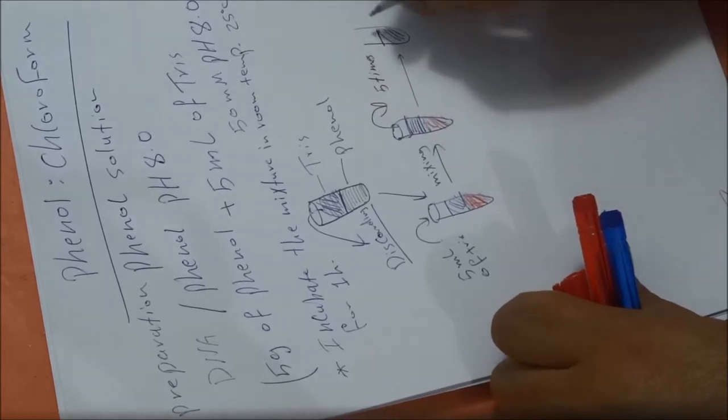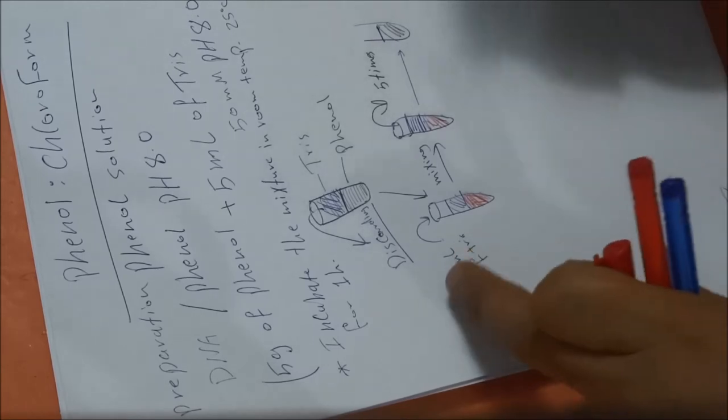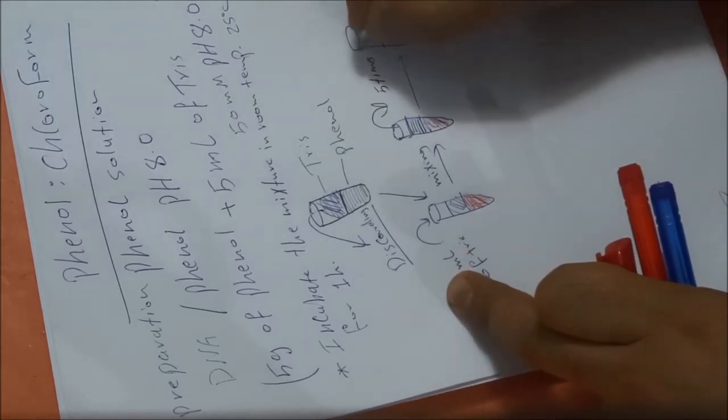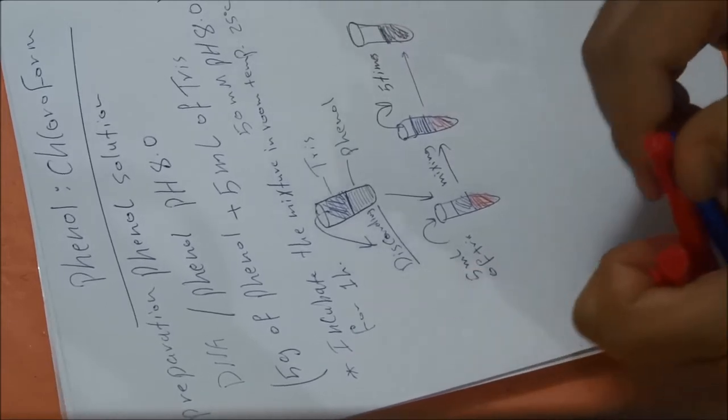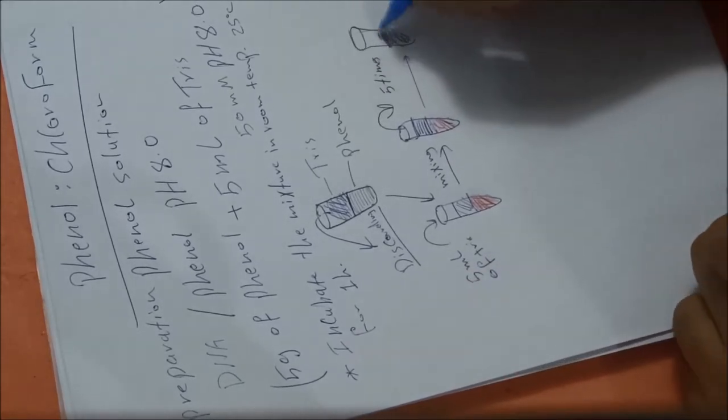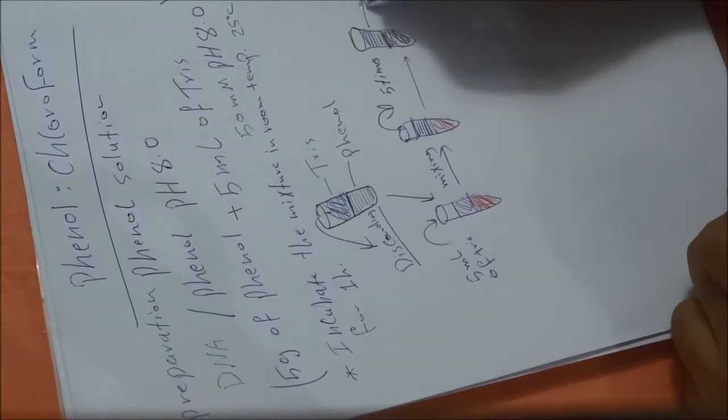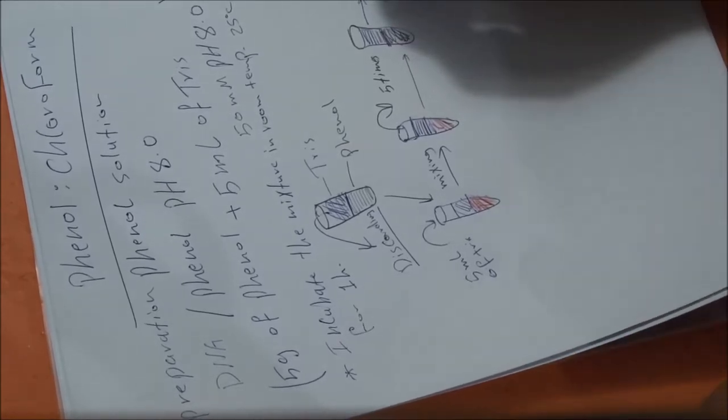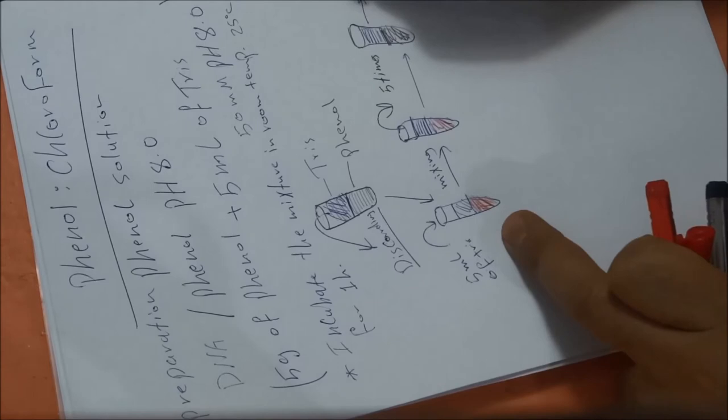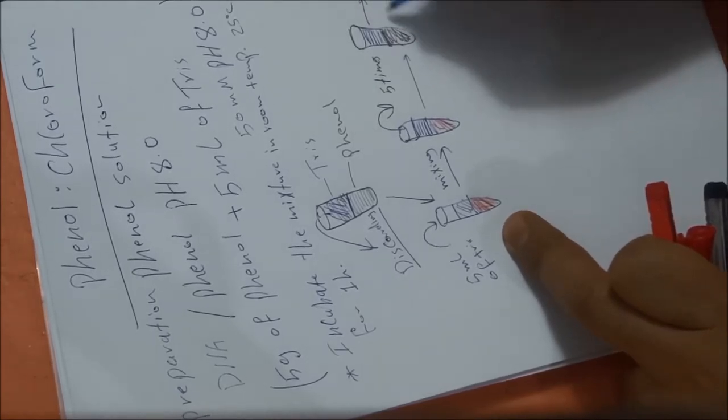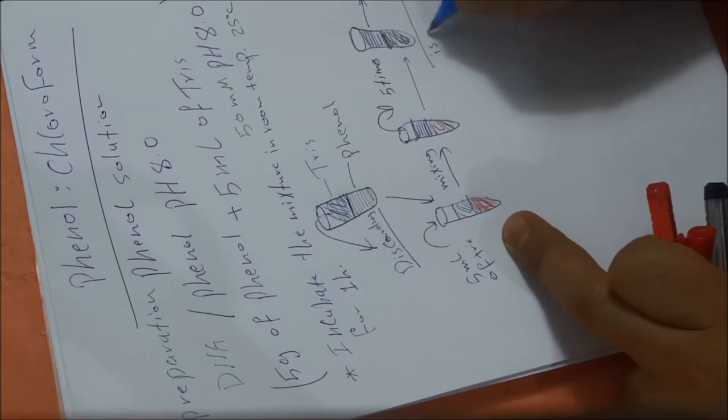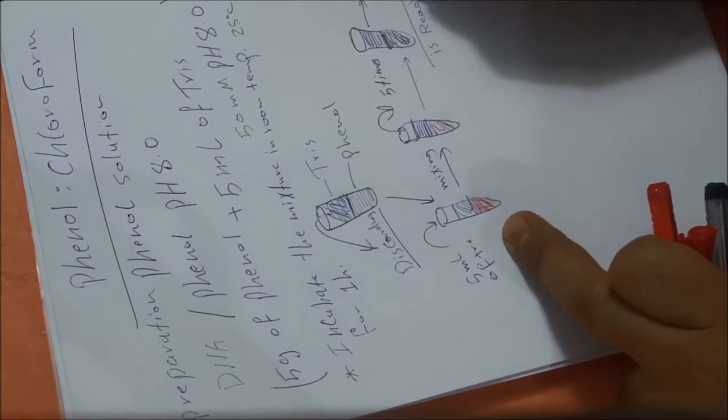After five times, you can measure the pH of the Tris after the phase separation, and you can see that the pH of this buffer will be 8. So now the phenol is ready to be used.